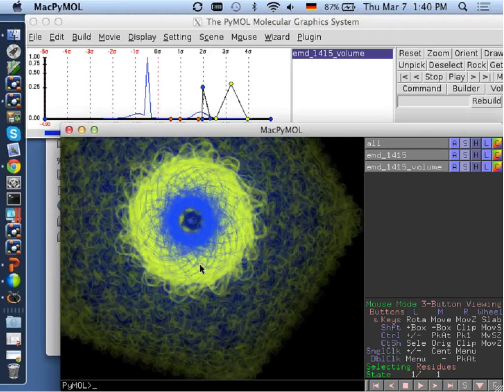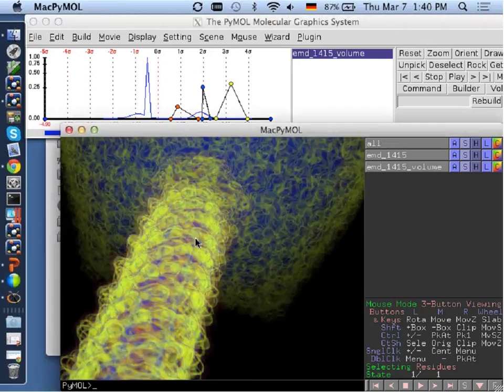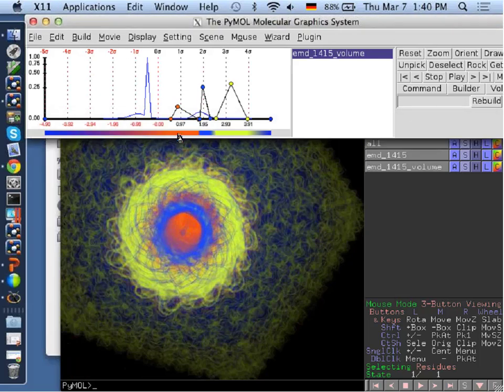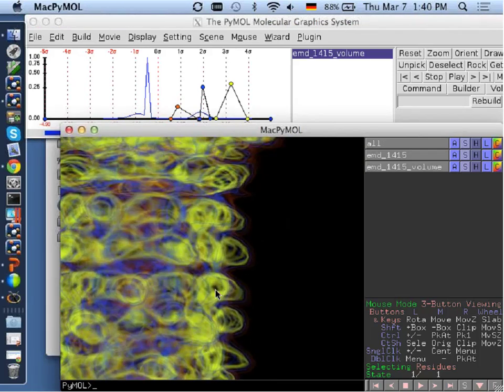And like this, it might suggest there is no density, but because we can place color with some transparency everywhere, we can really visualize this better than with just an isosurface, for example. And also on the surface, you see there are blobs coming up, which probably correspond to single proteins.